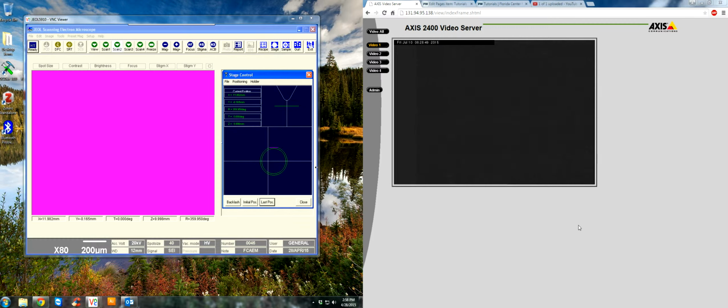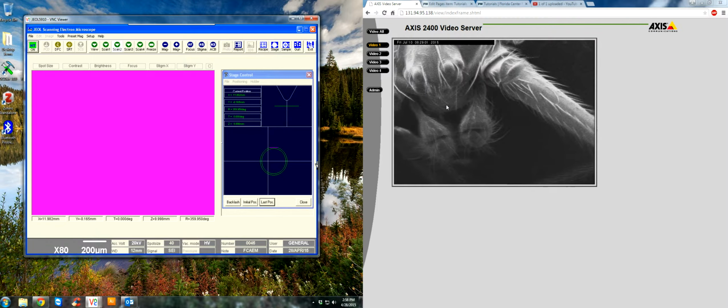Okay, now if you're interested in the general operating procedures in backscattered mode, you should watch this video. Let's turn the beam on. On our video screen, we have our gold-coated spider.